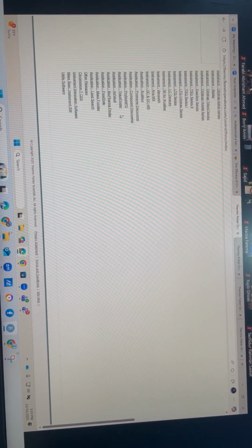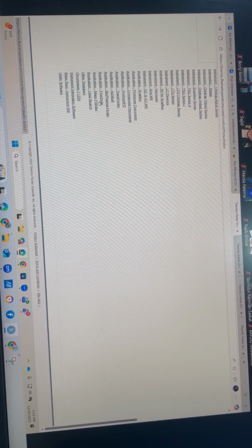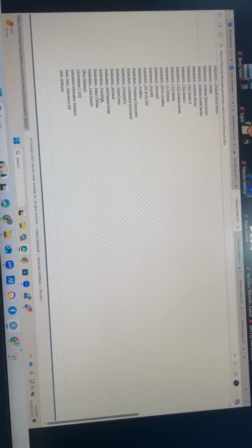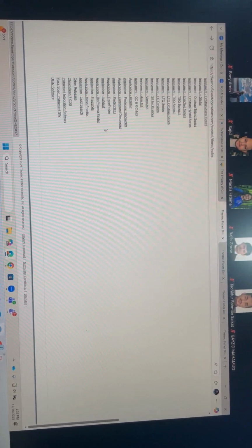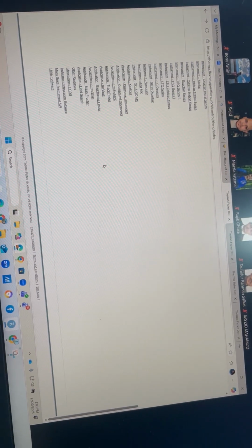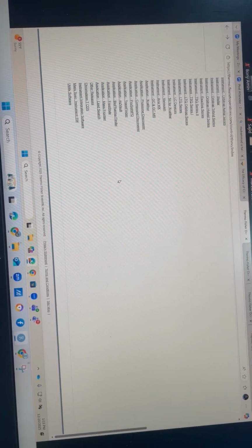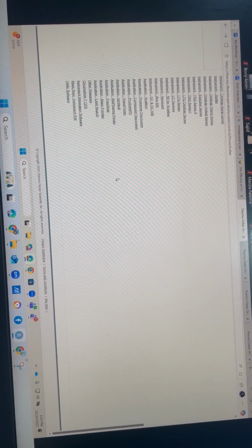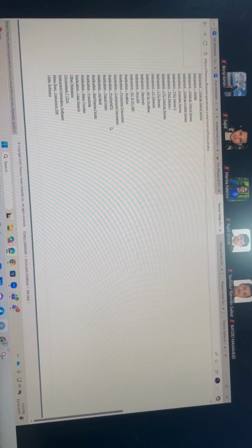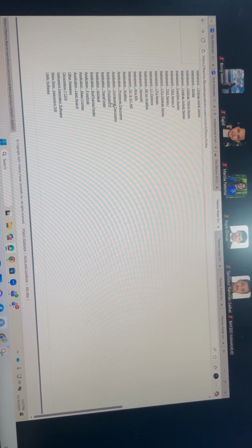Tomorrow we'll be using Freestyle and Excalibur, but especially Freestyle. So make sure that you download these 4 software. How many software do you need to download? 4. Okay, so one is Freestyle, Excalibur, Proteome Discoverer, and Compound Discoverer.